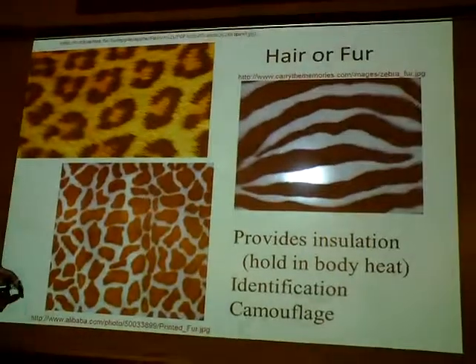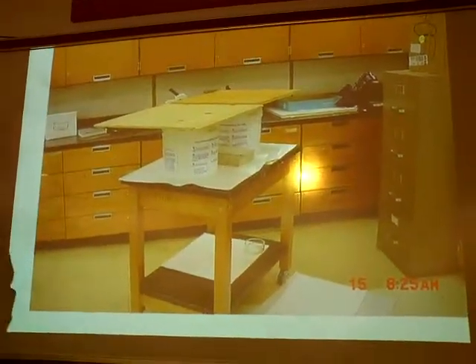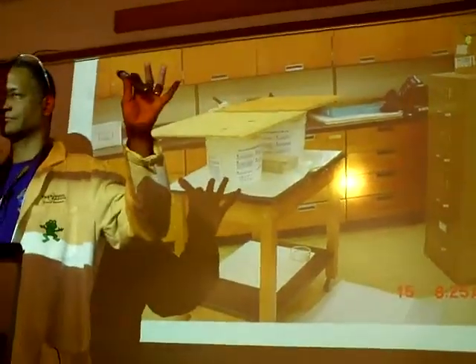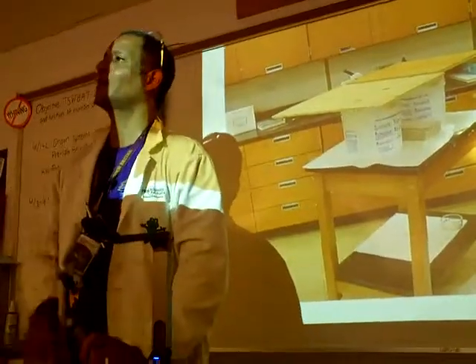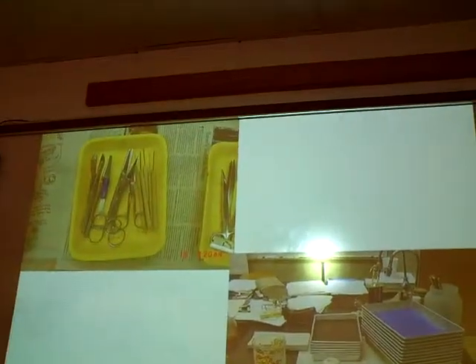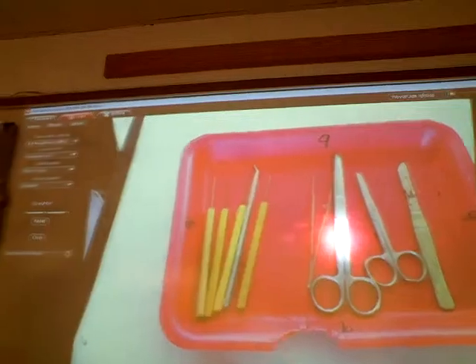I'm going to jump ahead to the equipment. Every year I do this, I like to show where everything is. In this room I've got five sinks — four inside and my fifth one is over there. If you look back there, you're going to see a gray bucket. The gray bucket is for cleaning your utensils.